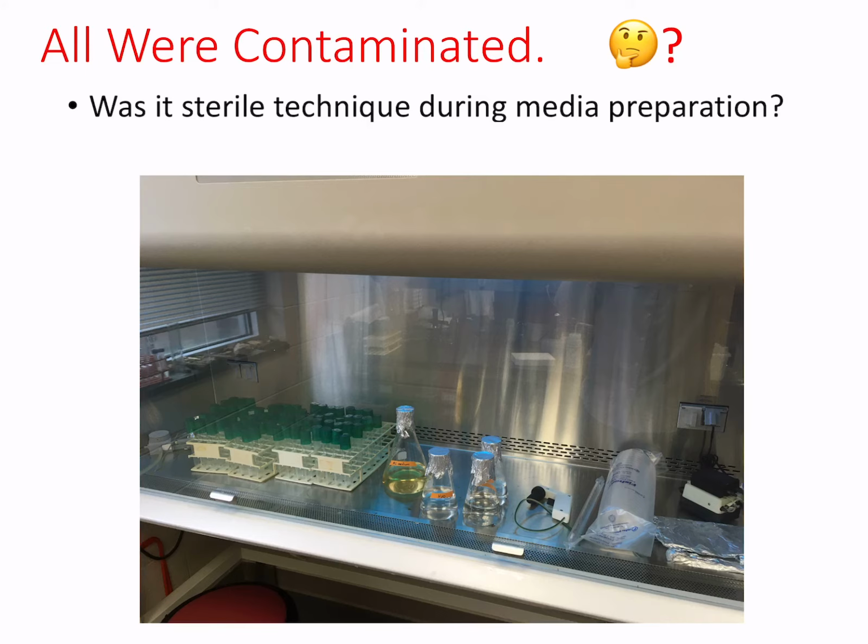First off, you go back and you question everything you did. Was there sterile technique during media preparation? This is where having really good documentation of what you did comes in handy. You want to write everything down, but I have pictures of everything too, so we can go back and review. So first off, was it sterile technique when I was preparing the media? What I come up with is that the Petri dishes are fine, and the media was all prepared at the same time. Since the Petri dishes are not contaminated, it probably had nothing to do with media preparation.